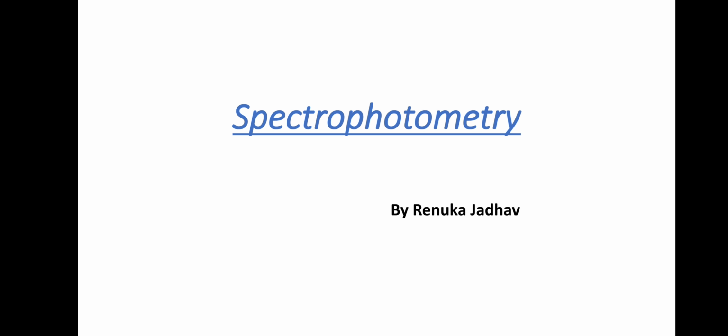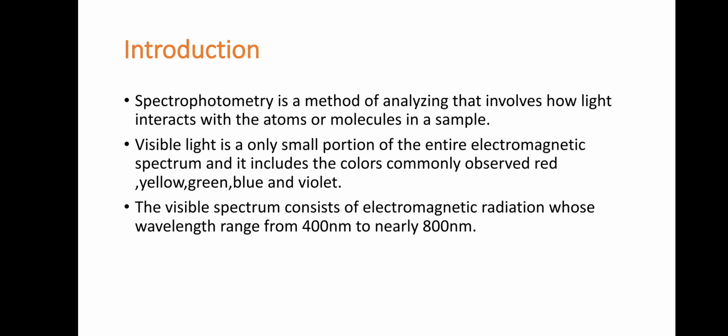Now we have moved towards the introduction. Spectrophotometry is a method of analyzing that involves how light interacts with the atoms or molecules in a sample.